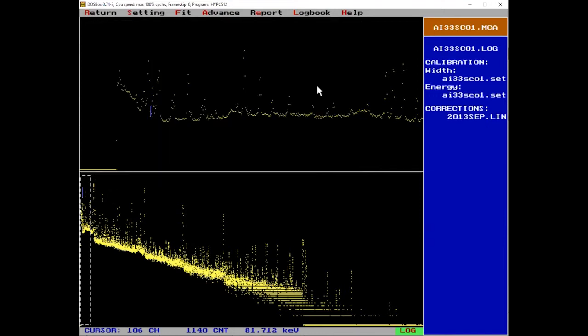And this allows the energy determination of gamma radiation down to 5 significant digits. So we can measure mega electron volts with one tenth of kilo electron volt precision. And this is rather demanding, but needed for accurate element identification.